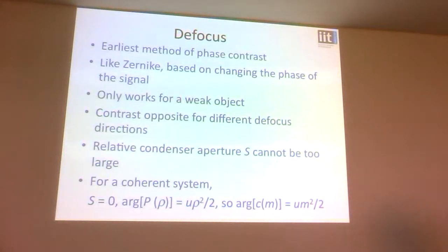Okay, defocus. I've already mentioned how you can use defocus to look at phase contrast. Effectively, if you think about it, it's very similar to Zernike, really. But instead of Zernike, where you've got this step change in phase, in defocus you've just got a gradual change in phase.